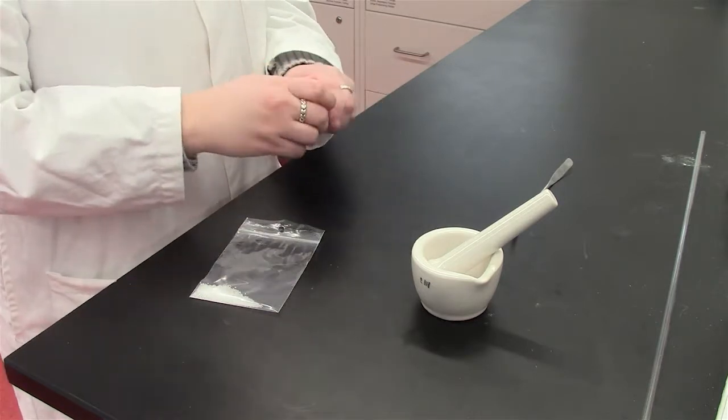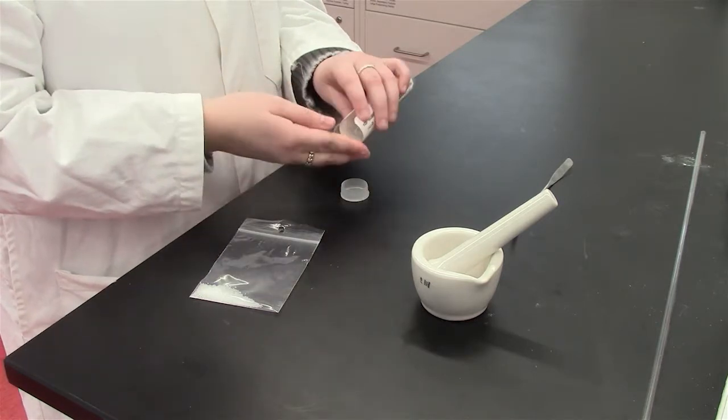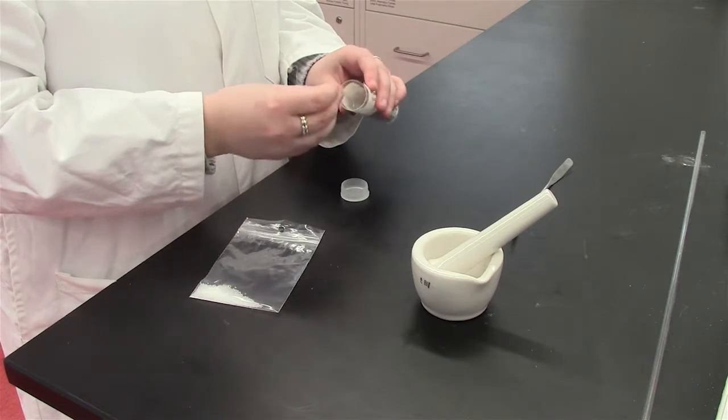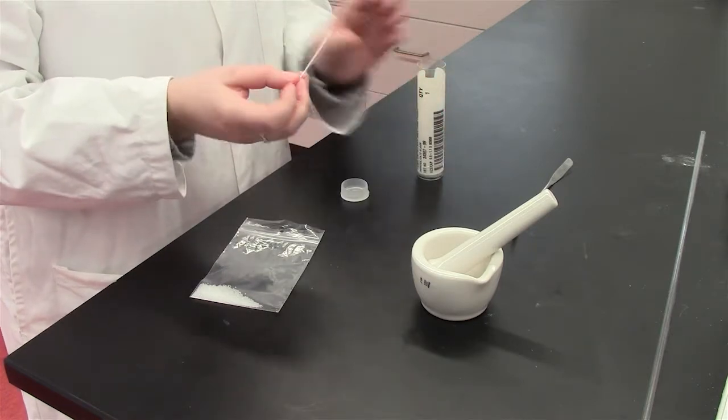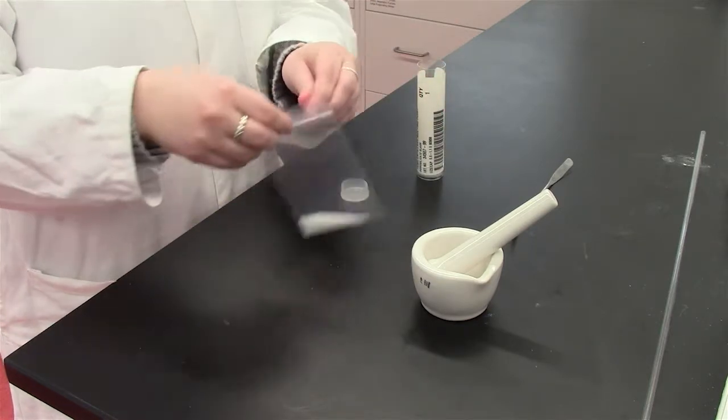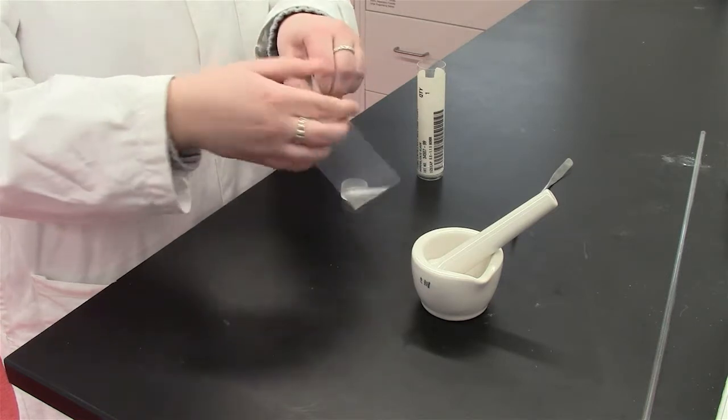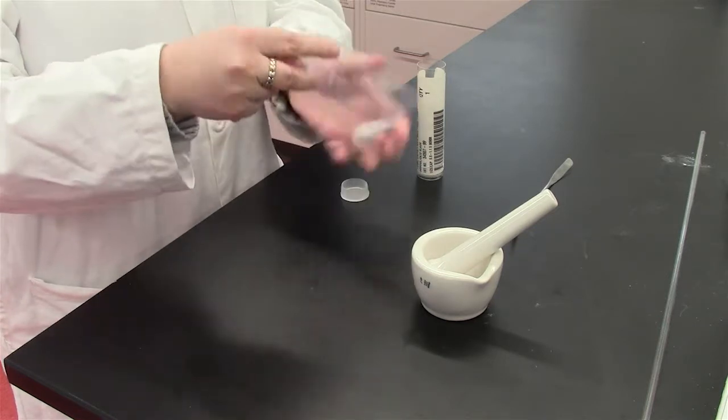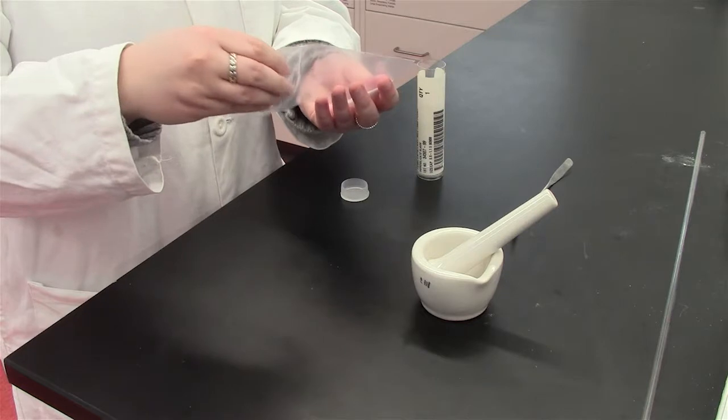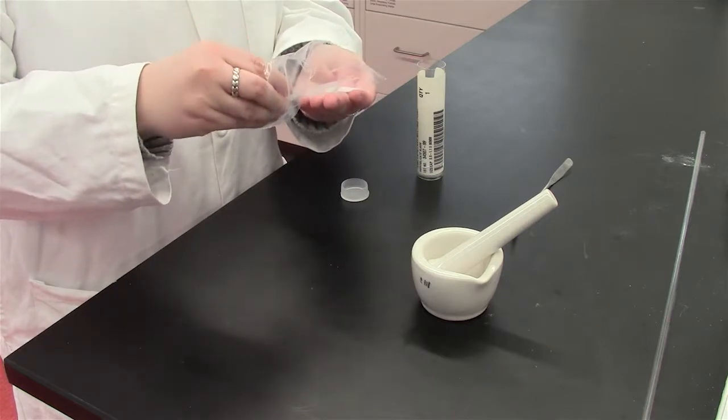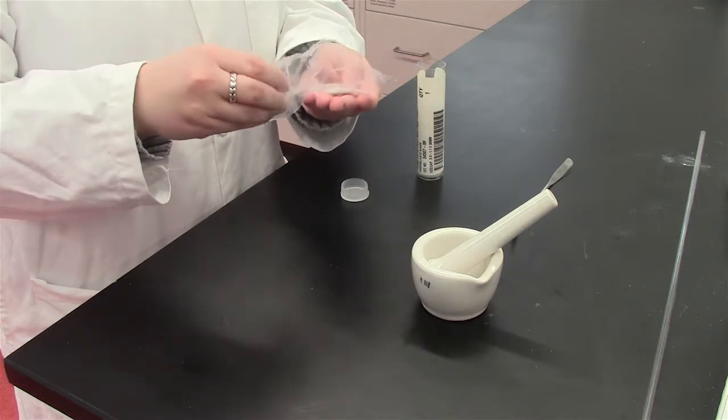Take a sample of your solid out of your sample bag that has been given to you by your TA. Using the capillary tube, obtain a small quantity of the fine powder by gently rolling the tube through the substance.